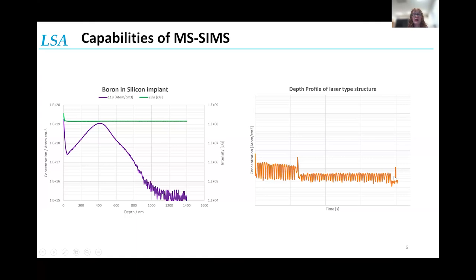And we can see the different aluminium content throughout the different layers, which can be really important for semiconductors, to make sure that they've got that continuity throughout all of these different layers so that their device will work properly.